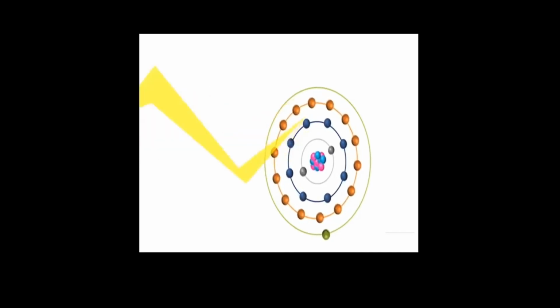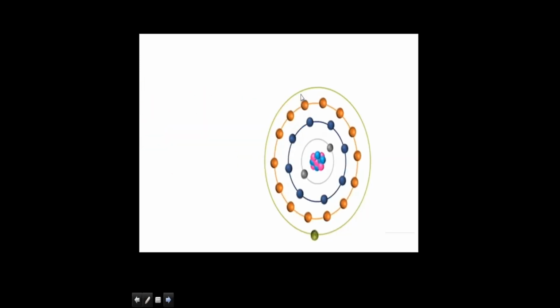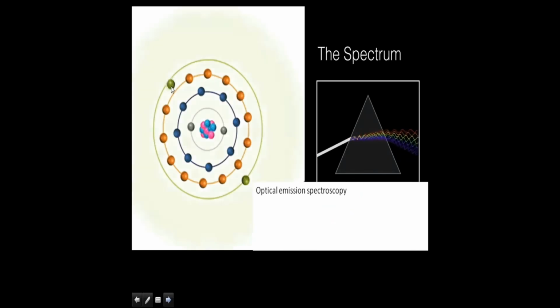It also excites atoms to an excited energy state, which subsequently emit light while returning to the ground atomic state or lower energy state. This light has a particular wavelength or frequency determined by the energy of the electron in transition. To quantify and identify the element present in the sample, these wavelengths must be separated. This light is dispersed into spectral lines using a dispersing element such as a prism or grating.